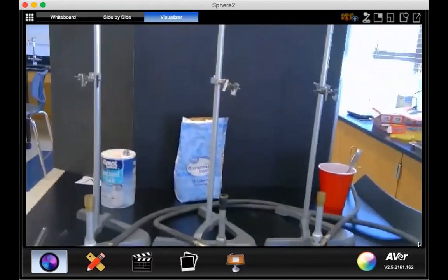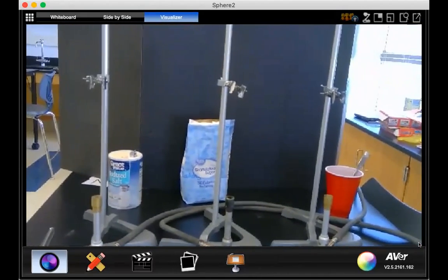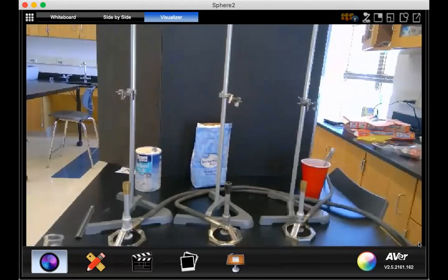And so I'm going to set this up for you as we look at our lab arrangement or apparatus. I have 3 test tubes and ring stands set up, 3 Bunsen burners. And what we're going to do is, like I said, we're going to try to run all 3 of them simultaneously and see if we can't get a good result from there. I'm going to heat everything up today in test tubes. Okay, we're just going to use test tubes here.